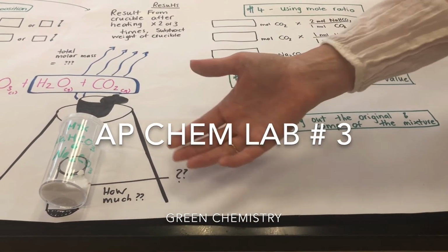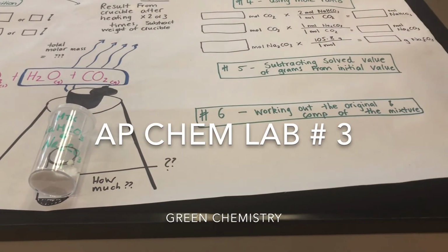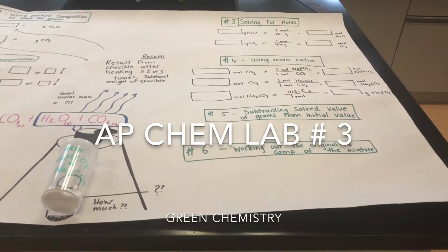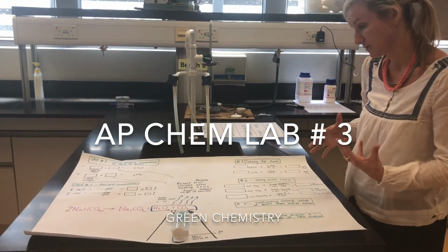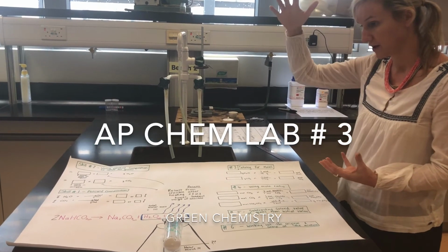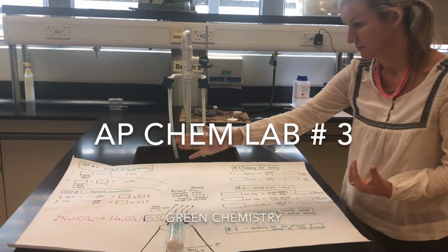Is it 50% NaHCO3 and 50% Na2CO3? Is it 60-40? You don't know. You're aiming to find out what those two percentages are. When you submit this to me, you will do your own flowchart. It could be similar to mine. You could color code it, or you could work going down a page. I've done mine as a cyclic process.